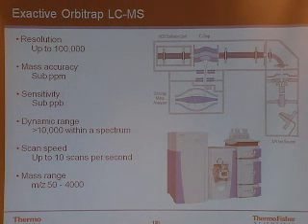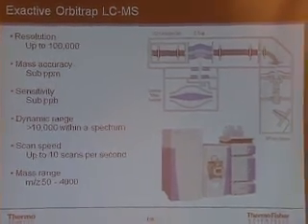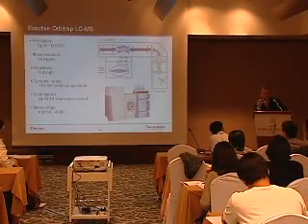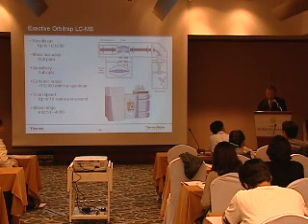As I say, if the molecular weight of my compound of interest, let's just say, is 350 AMU, okay, this will give me the molecular weight to 350.0000001 AMU. Okay? Now you might ask, how does that do that? And the answer is very carefully. Okay? The point is, now you don't have to do calibrations because this is based on accurate mass.